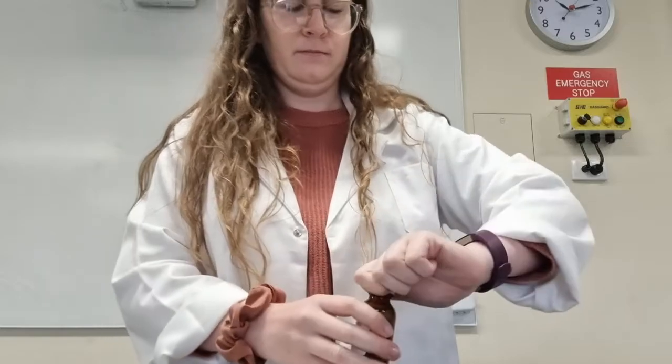I should pull up my lab coat and put my hair back. Can you tell it's been a while since we've done pracs with chemicals?